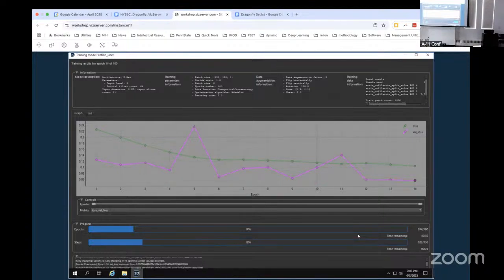Go ahead. Oh, that was fast, that's not good. So just do the same command. Oh, yeah, okay, it's the next step where you decide that. So then both of that makes one.